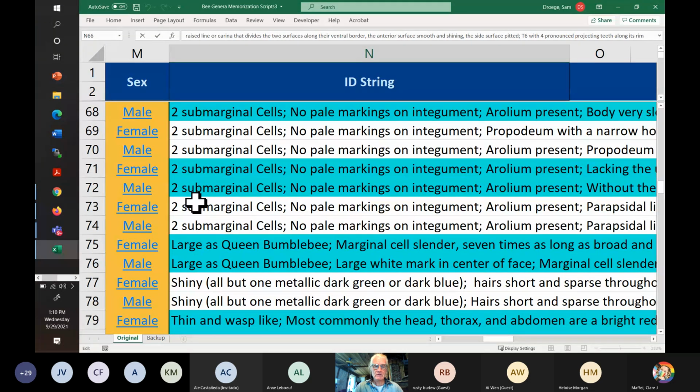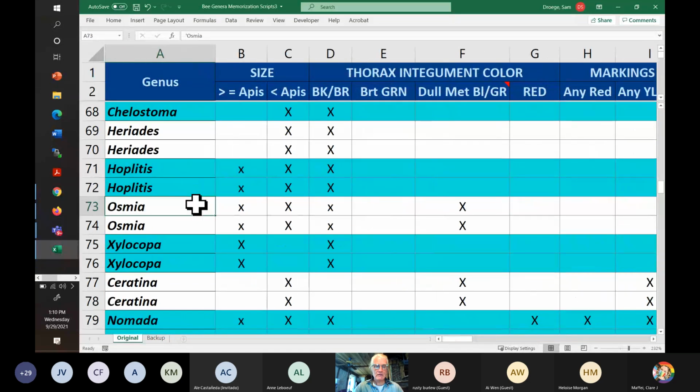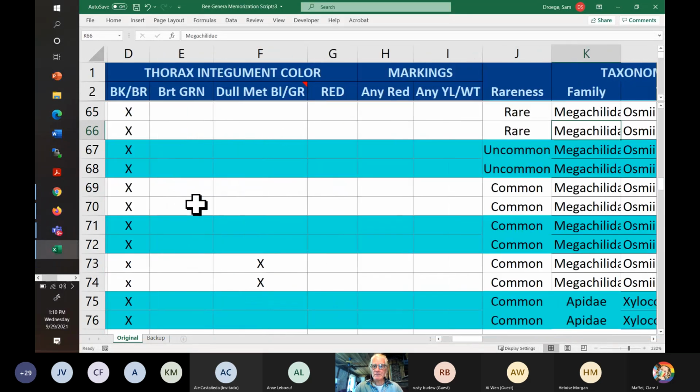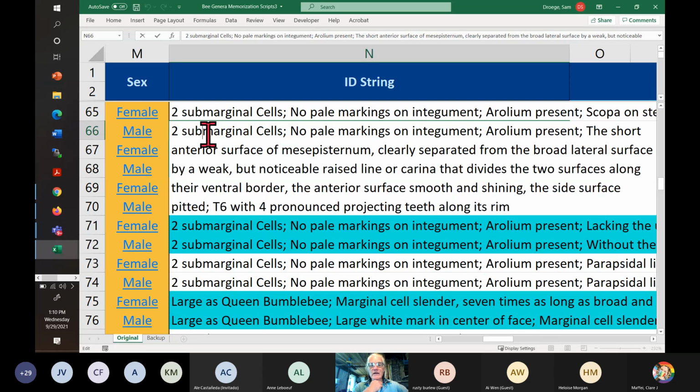Let's see, just going to make sure I am in the right spot here. I changed to Osmia, and I want to be in Ashmeadiella land, going over and back. Okay, so the male, there are no pale markings. Stelis, and some of the Stelis subgenera look a lot like this too, have pale markings on the abdomen. They have none. The arolium is present, as it is in most bee genera and species.